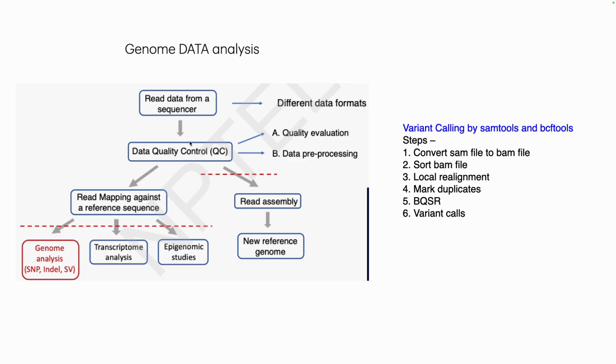So in the sequence which is of our interest that we have assembled with the reference sequence, now we want to see whether the sequence that we had is exactly the same as the reference sequence, or is there any change in the genes which might be responsible for any change in the overall phenotype of an organism whose genome we are getting. So for that we need to further analyze our data.